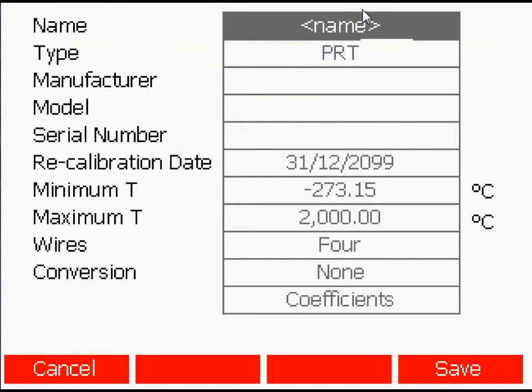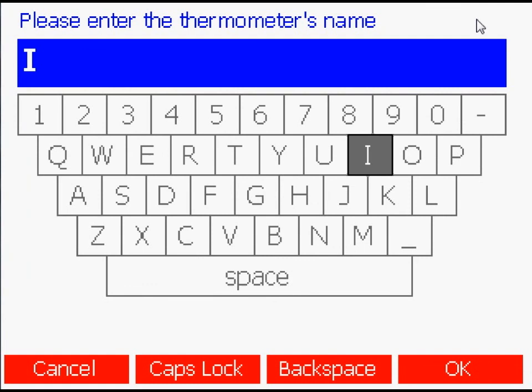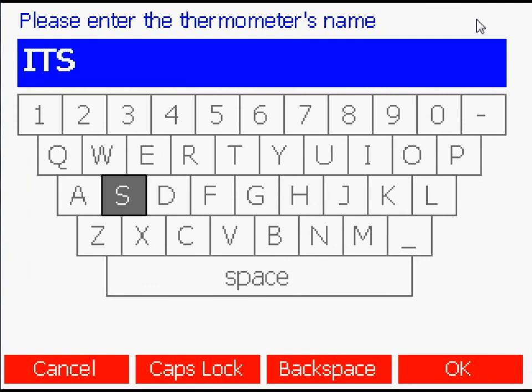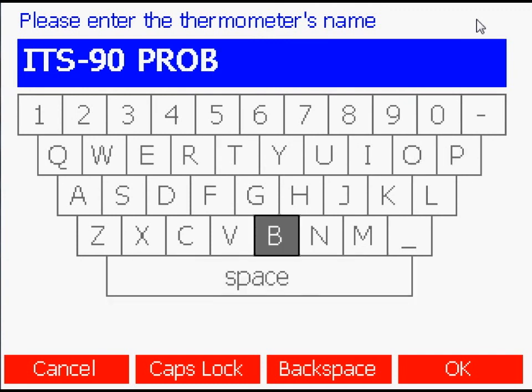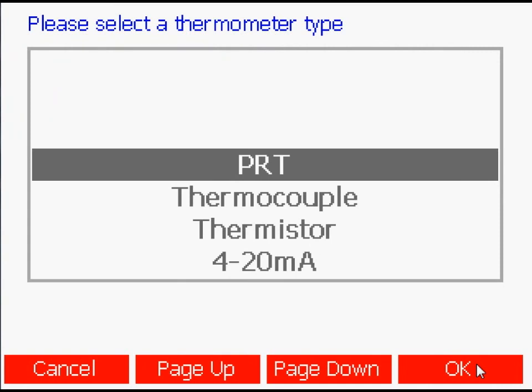Using the up and down arrows, select each section and enter the relevant information for the probe you wish to add. First, the name of the probe, the type of probe you are using, the manufacturer of the probe.